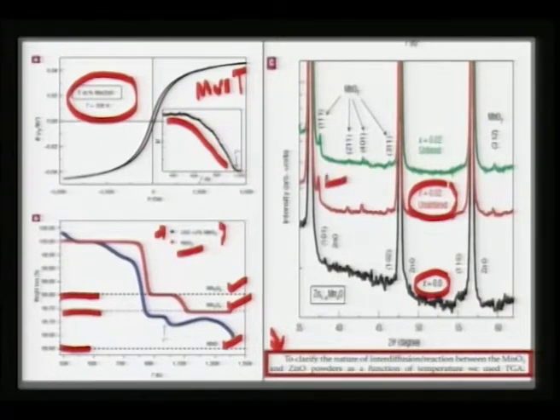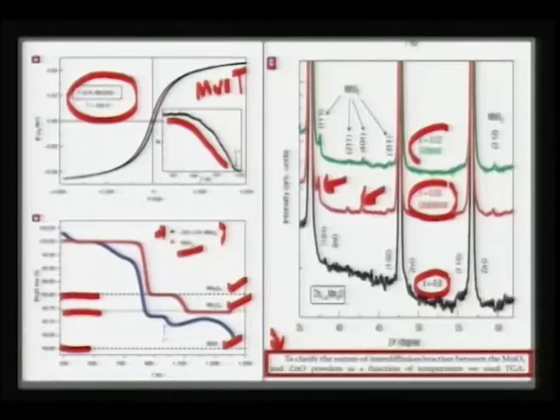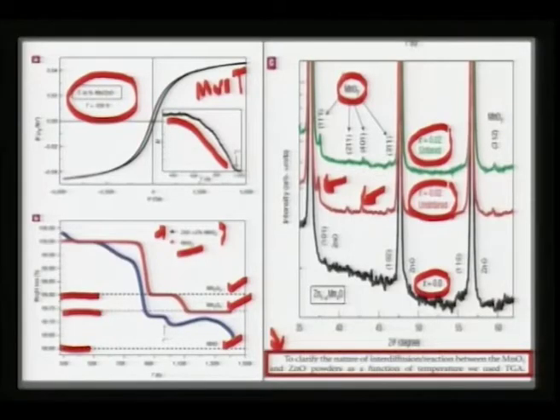So, for example, this feature, and these are some of the features that are coming only if you physically mix MnO2 with ZnO. So, this is the feature. Number 2, if you start sintering this compound below 700 K, you see still there are reflections of MnO2 here. There is one reflection of MnO2 here, there is a reflection of MnO2 here, there is another one here, there is another. In other words, even at 700 K, you do not seem to see this MnO2 signature vanishing. Now, why was this missed out?